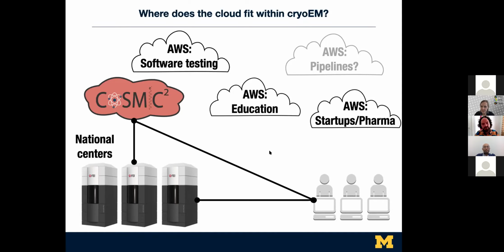Or just the tools to help you do further training. For instance, training on, we wrote a micrograph assessing program that we call MicAssess, or having ways to have people upload data sets and further train neural networks. We definitely have thought of that. I think AI is definitely in cryo-EM with particle picking and continuous flexibilities. But I think there's probably more to be dug out of data and micrographs.